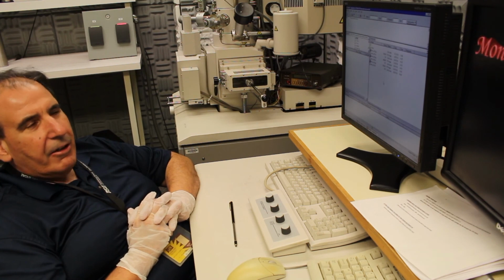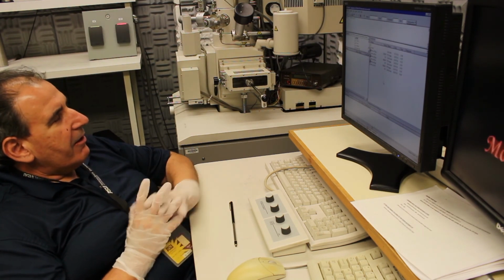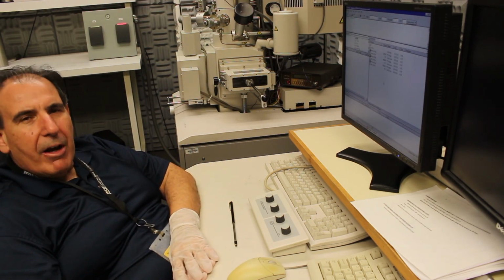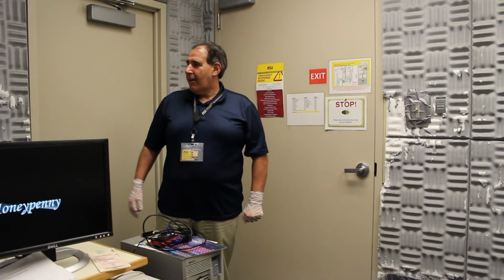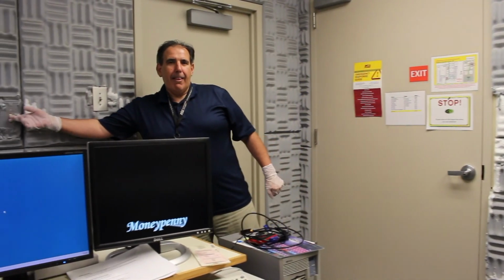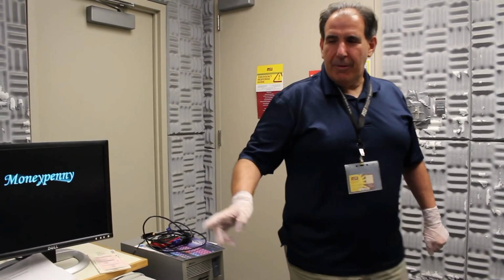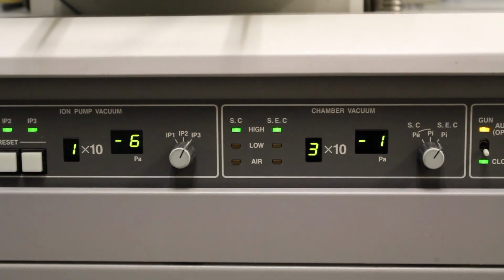In other words, it can crash. So be warned that you need to delete the files within 2 or 3 weeks after you've acquired them on the desktop. And before you leave the lab, turn on the fan and check that the vacuum in the specimen exchange chamber is at base pressure, which it is.